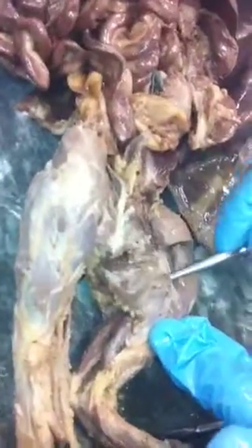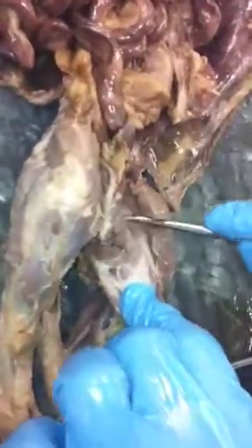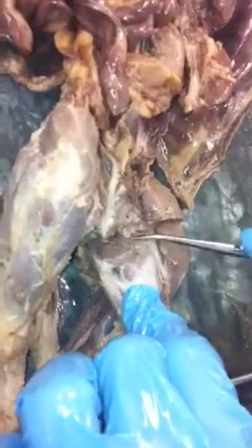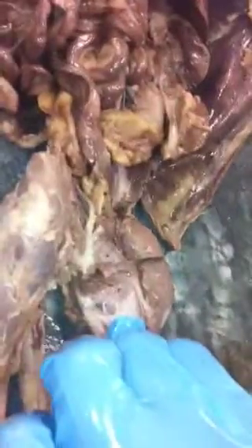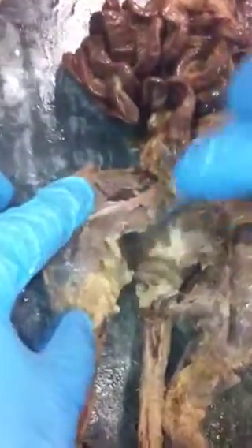This is the first layer. And the second layer right here is cut. What's cut is this right here. When you cut this, this is the gracilis cut. Then you have these two splits, right? You see that division? Adductor longus and adductor femoris. Then you have your third layer right here to the bottom. This is all fat, so if we got all that fat off, we'd have this part right here. That is the semitendinosus.